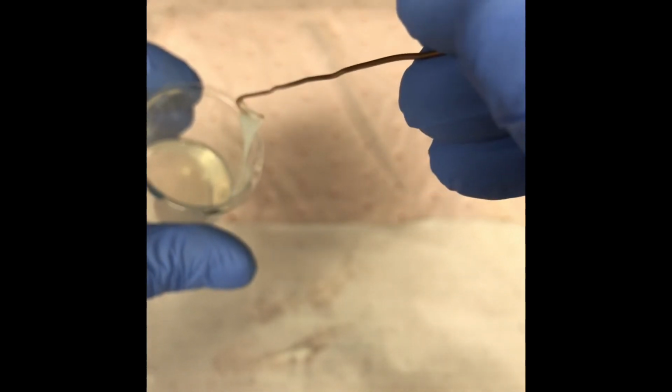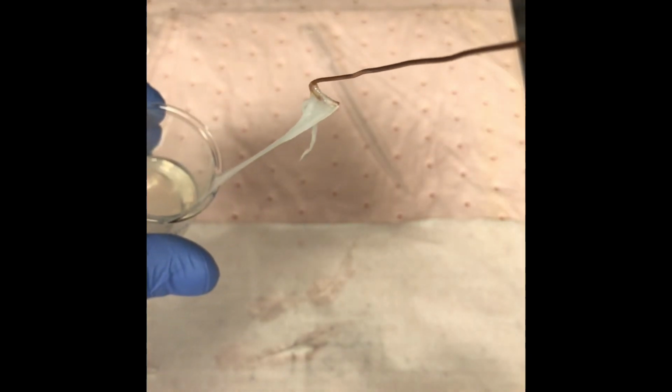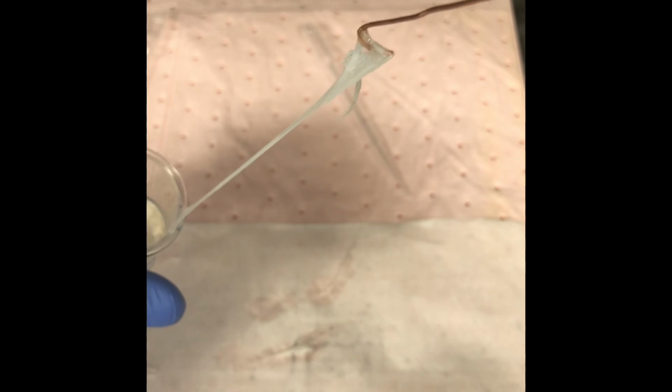Let's see. Now I'm just pulling out pieces of nylon. That's a longer strand. Look. Oh my. Look at that long strand coming off. Finally, I got a long strand. I'm going to stop this after about a foot or two. But again, if you do this well, you can actually pull this out for many, many feet and yards. All right, I'm going to pause the video. I'm going to put the strand down. I'm going to let it dry. And when we come back, we'll look at its properties.